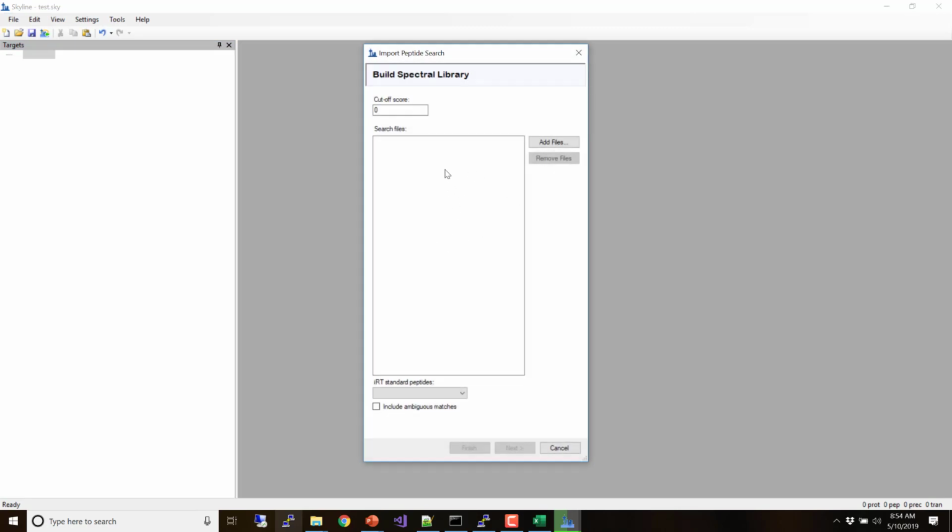So here's the search cutoff, you know, we would go 0.9. We've been jumping into a few things because I've got some stuff pre-built, but this would take you through all the steps to build a library and stuff like that. So that's one thing, and then there's certainly tutorials that you can walk through and relearn all the steps.